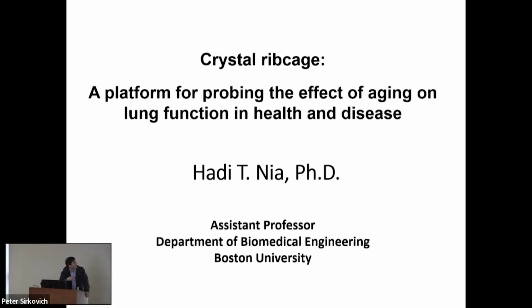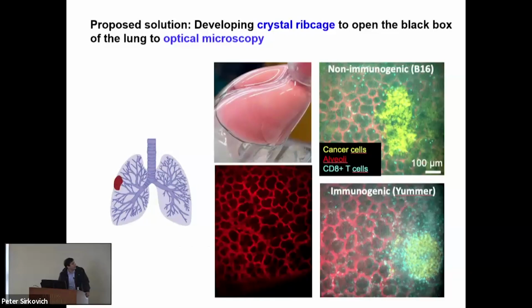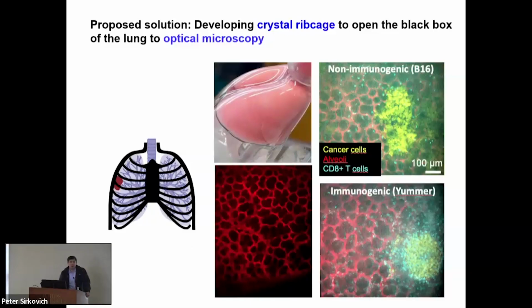I'm going to tell you about crystal ribcage and its application in cancer, not aging. Aging is also another application from the previous research on tap. So we are interested in imaging the lung in real time at the cellular resolution and in a functioning lung.